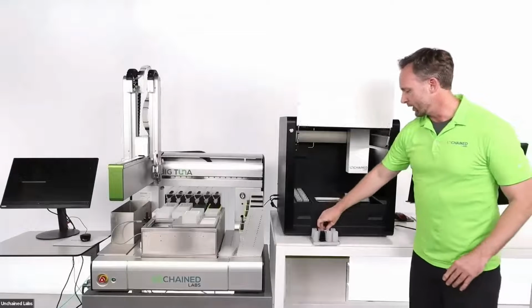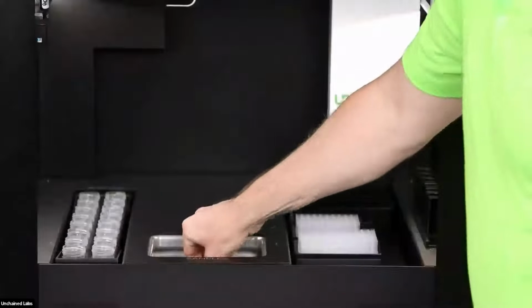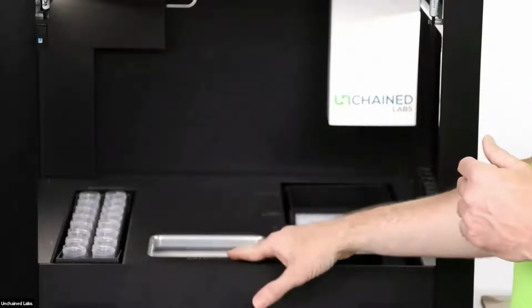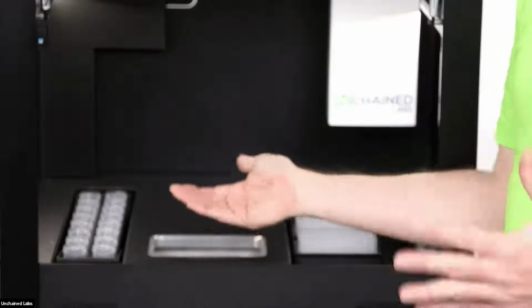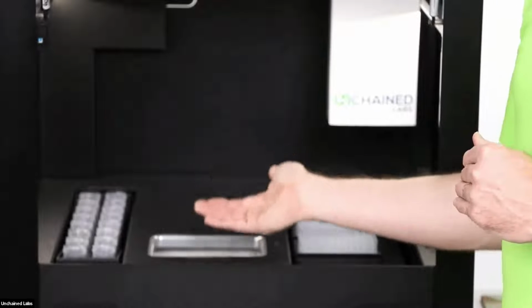Here, I'll just go ahead, because I'm forgetful, place the sample rack in there, twist it in, pretty easy. And again, this is the buffer exchange chamber, that same technology. So this is where 15, 30, and 60 psi pressure will be applied. The other aspect of this, I mentioned it briefly earlier, you can't really see it in a demo, but we do have an orbital mixer at the bottom.